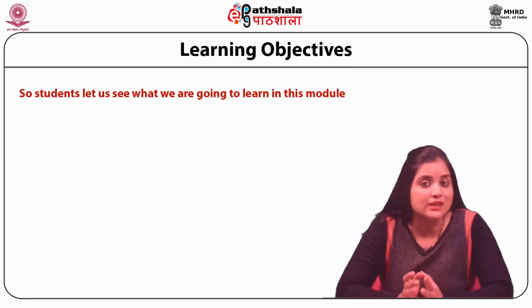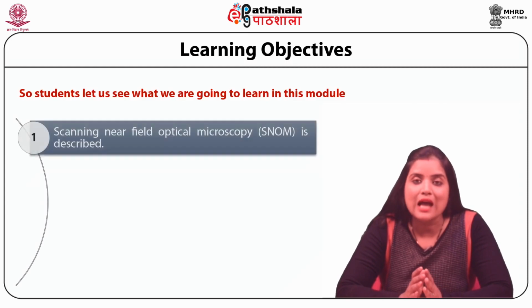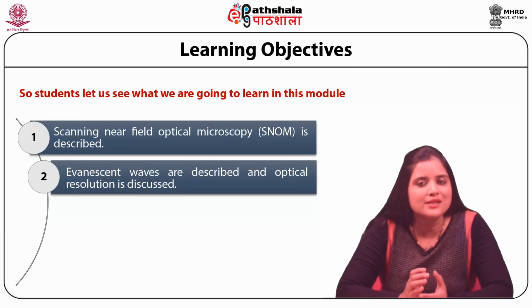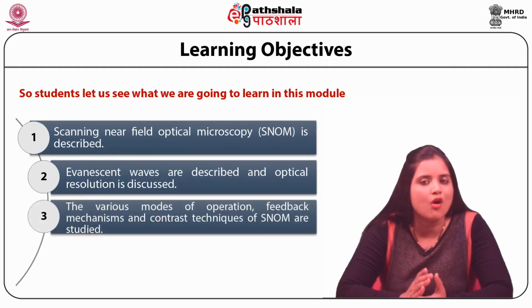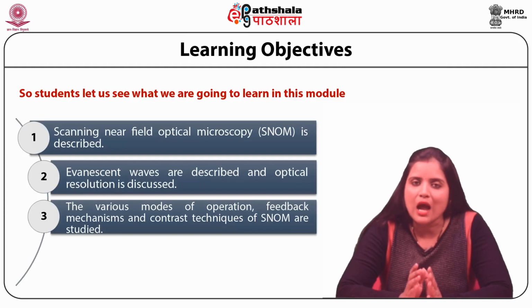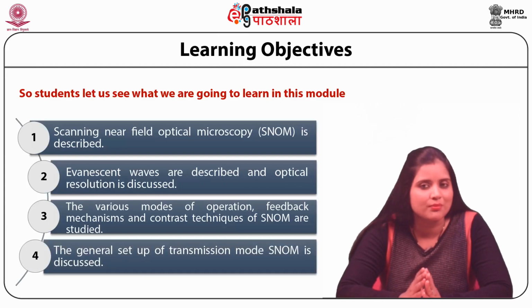So students, let us see what we are going to learn in this module. In this module, scanning near field optical microscopy, that is SNOM, is described. Then the evanescent waves are described and the optical resolution is discussed. The various modes of operation, feedback mechanisms, and contrast techniques of scanning near field optical microscopy are studied in this module. Also, the general setup of transmission mode SNOM is discussed.